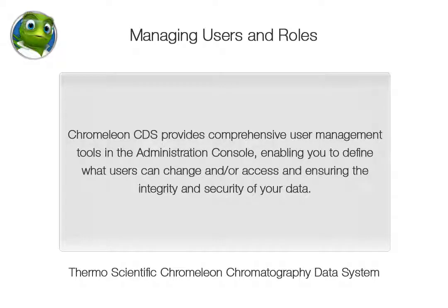Chromelion CDS provides comprehensive user management tools in the Administration Console, enabling you to define what users can change and or access and ensuring the integrity and security of your data.